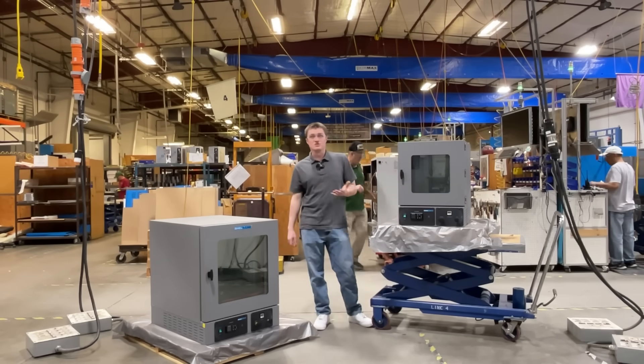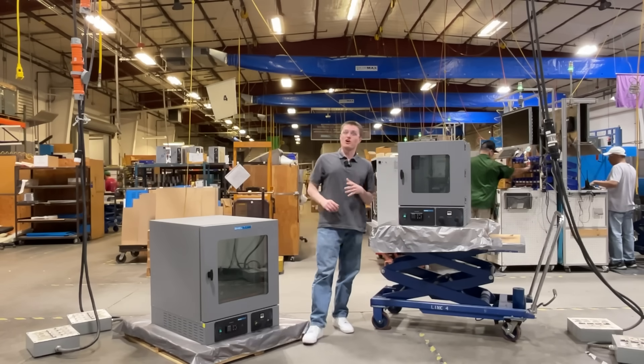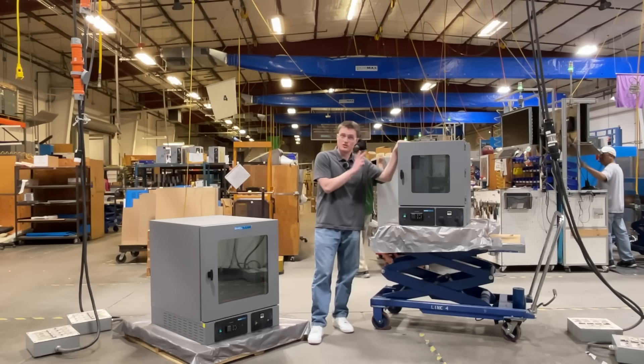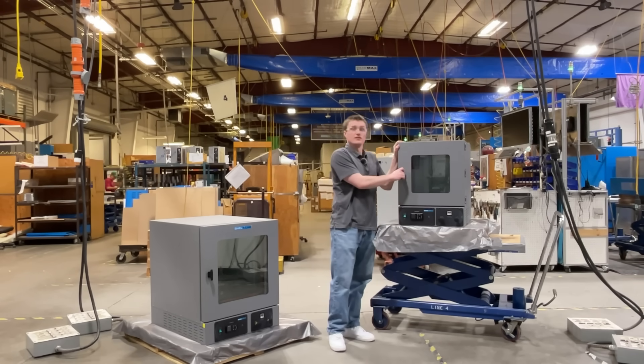Located on the left, you will see the SVAC 4, and on the right, the SVAC 2. These units are identical outside of the capacity, with this one featuring 2 cubic feet and this one 4. Now, let's take a look inside the units.